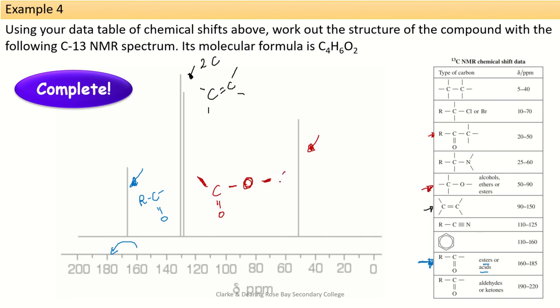So we're expecting to have 2 carbon-carbon bonds. I'm going to draw them here. Obviously, because they are deshielded, you expect them to be relatively close to this oxygen atom here. And we've predicted the ester group, this bit here, because this says from 50 to 90, and obviously this is already over 50, which discounts this one that we have here.